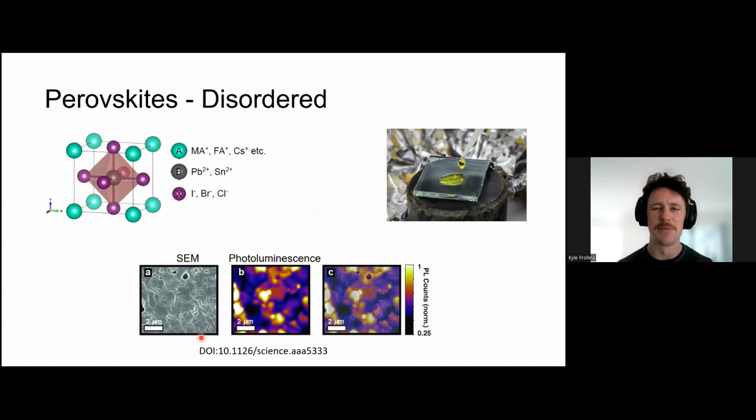On top of it, he did some confocal photoluminescence microscopy, and basically found that there were some grains that were extremely bright, and by proxy have a high quasi-Fermi level splitting or voltage, and other regions that were extremely dark. And there was a lot to be gained by saying, what if we could turn all of the grains that were dark into the super bright? Why are those grains incredibly dark versus other grains incredibly bright? I think that was a big inspiration for some of my work and the work of many others in the field, for sure.